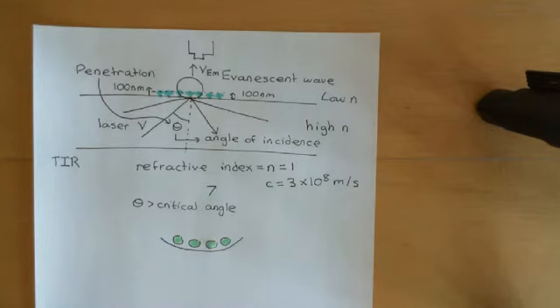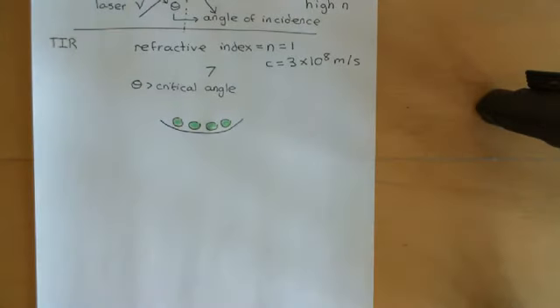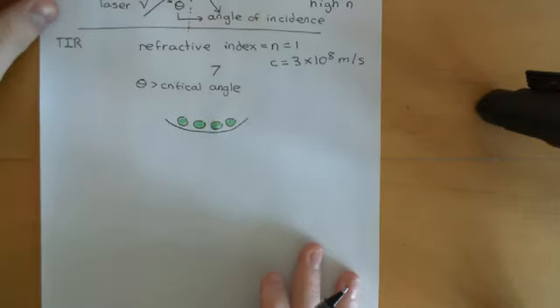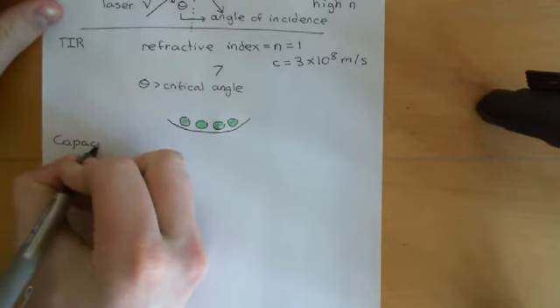Right, so the final two techniques that I'm going to tell you about are other ways of measuring the exocytosis of vesicles in real cells. One of them is capacitance measurements. You can measure the change in capacitance across the cell membrane of a cell. The other is amperometry, which is a way that you can measure the amount of neurotransmitter that has been released, in certain cases for neurotransmitters.